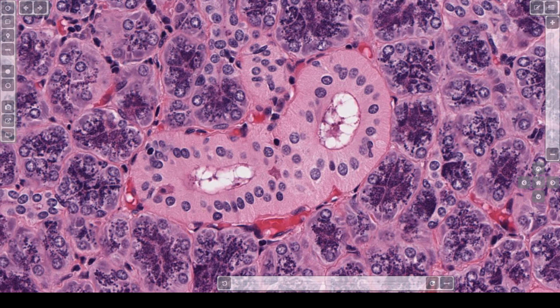This is a striated duct. You can see the striated duct is composed of a single layer epithelium. The name striated comes from these light striations you can see here, which I am going over with my cursor. These striations result because these cells have a lot of mitochondria, which are required for energy, which this epithelium uses in order to do ion transport as part of the management of the fluids that go through the duct.